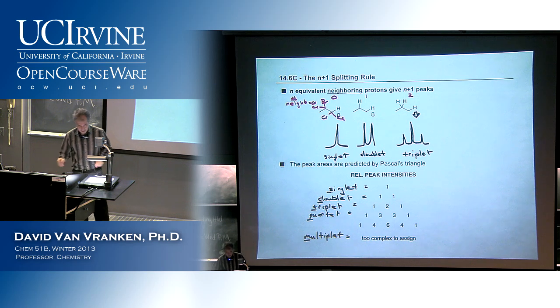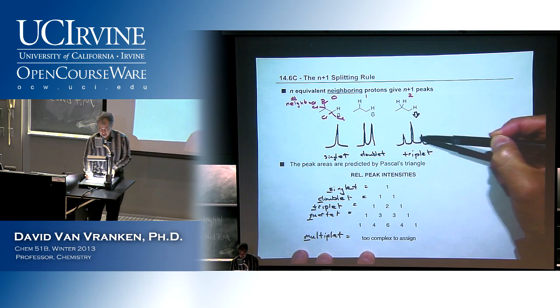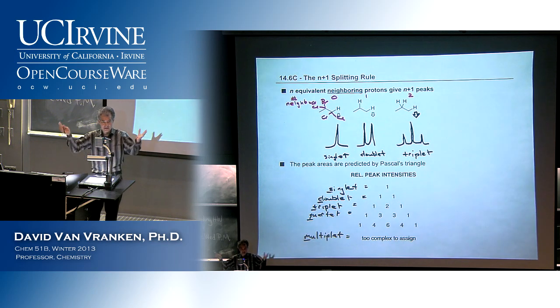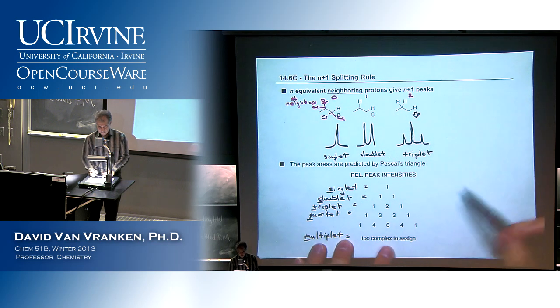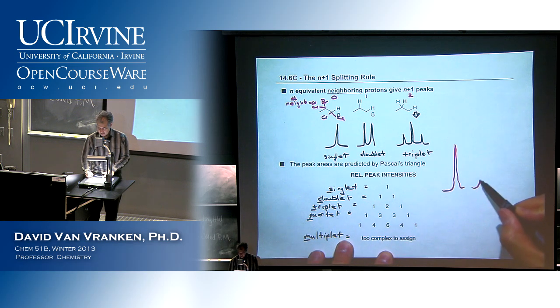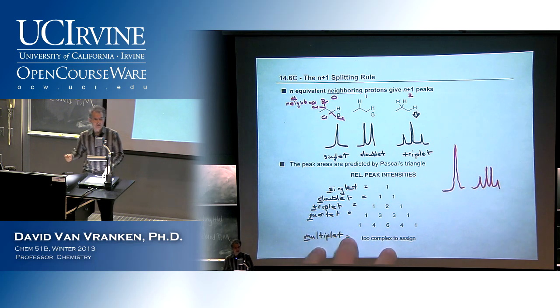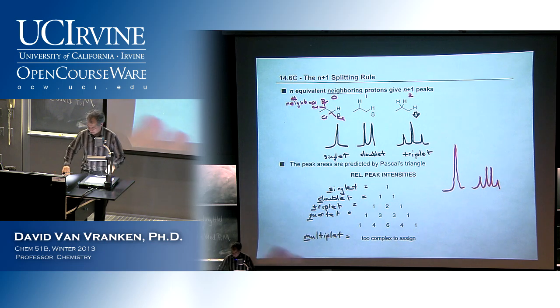Because in this scenario, this is all due to a single proton. So the area under here has to equal the signal given off by a single proton. And so here, this is given off by a single proton. So in other words, a singlet might have an intensity that looks like this. But a quartet, even though the area adds up to the same, will look smaller. But if you add up the area, it would be exactly identical because it would arise from a single proton in the spectrum.